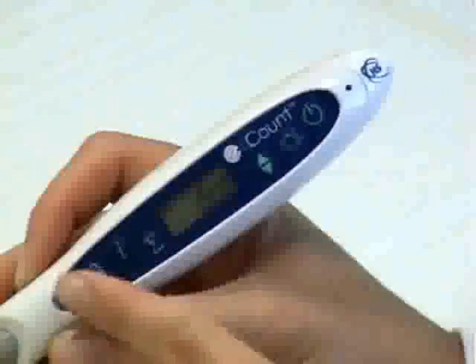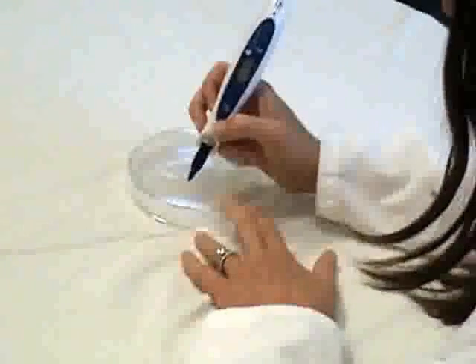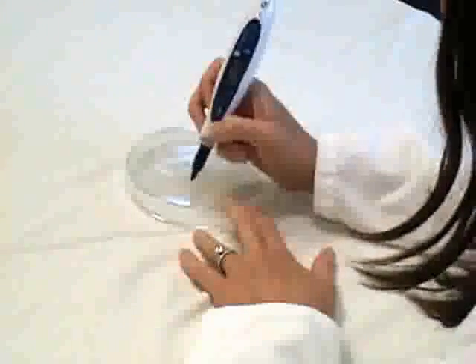By pressing the bell button, you can choose to verify each count with either a beep or LED light flash. The Heathrow Scientific E-Count makes colony counting simple and fun.